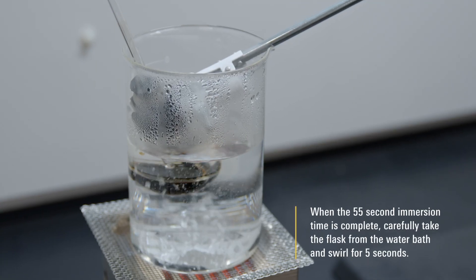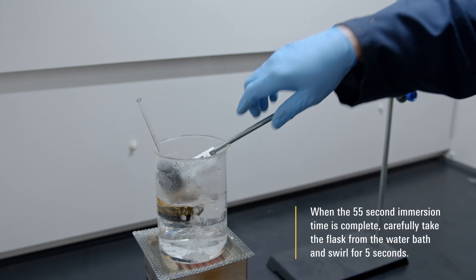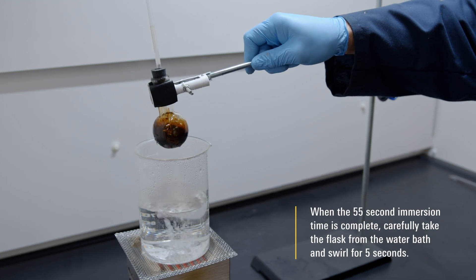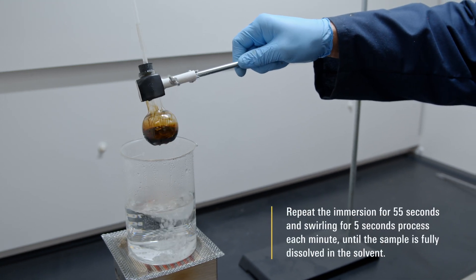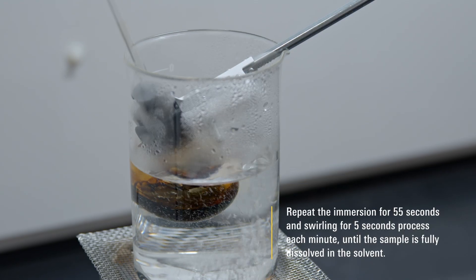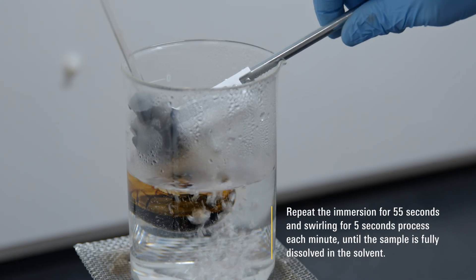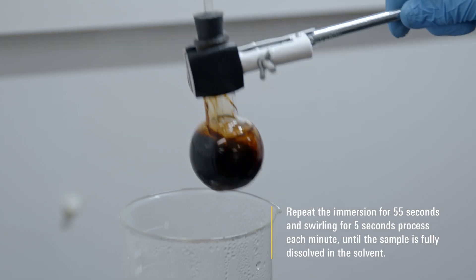When the 55 second immersion time is complete, carefully take the flask from the water bath and swirl for 5 seconds. Repeat the immersion for 55 seconds and swirling for 5 seconds process each minute until the sample is fully dissolved in the solvent.